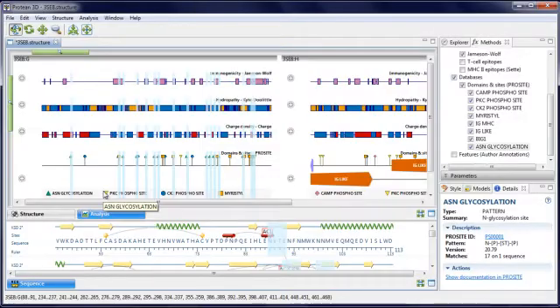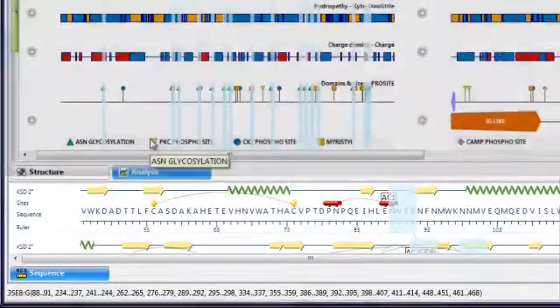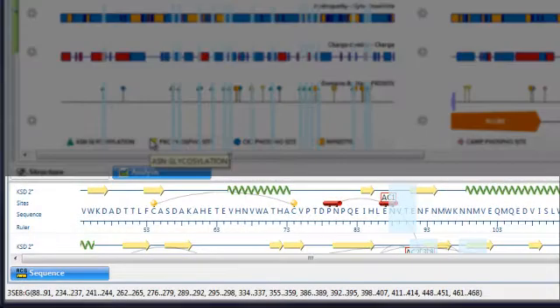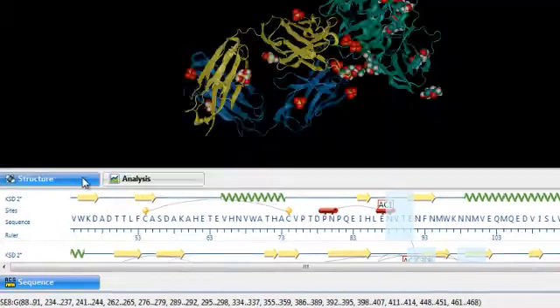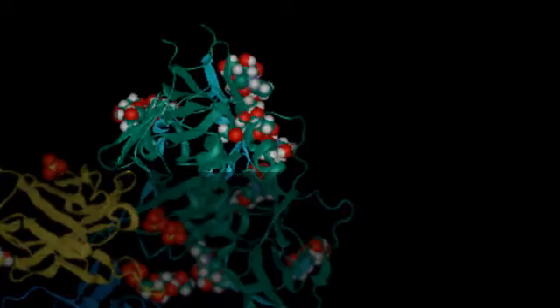Notice that with each selection I make, the corresponding region is also selected in the sequence view and the structure view.